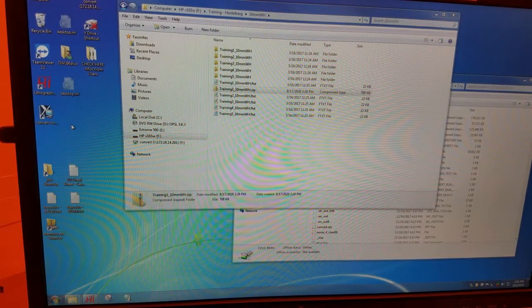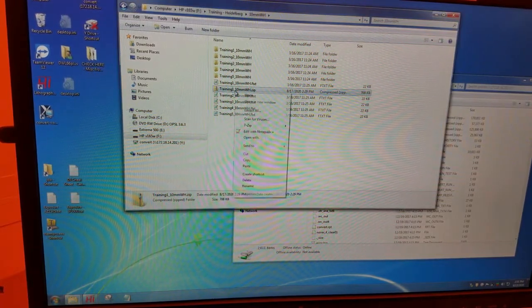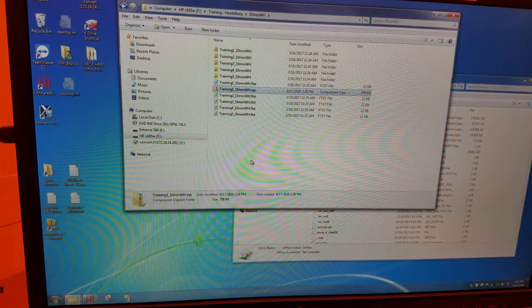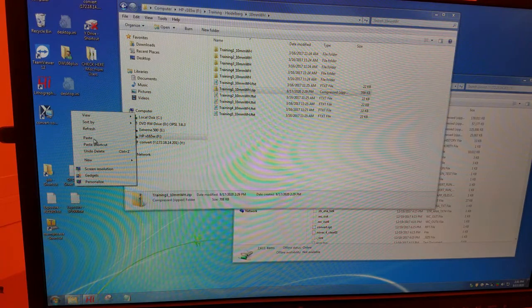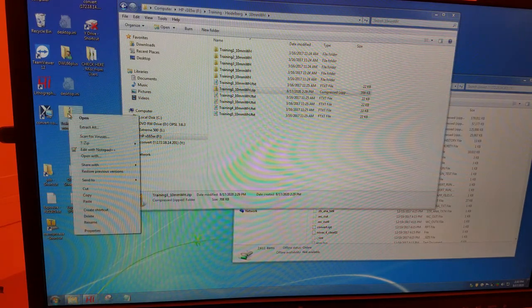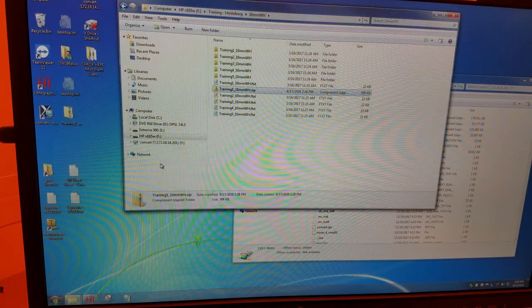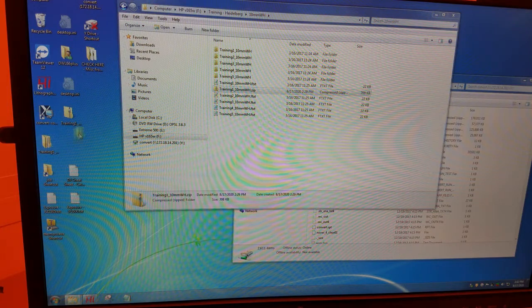If you zipped your data, there's one extra step to be careful of. Copy your zipped folder, paste it onto the desktop, unzip it, and find the unzipped folder.